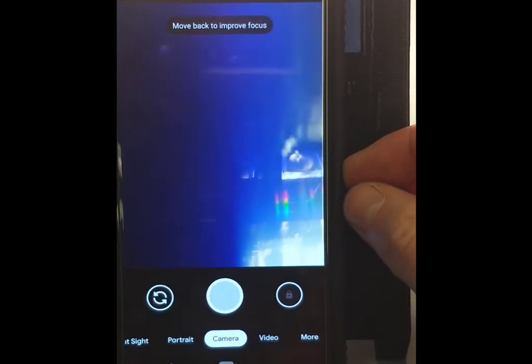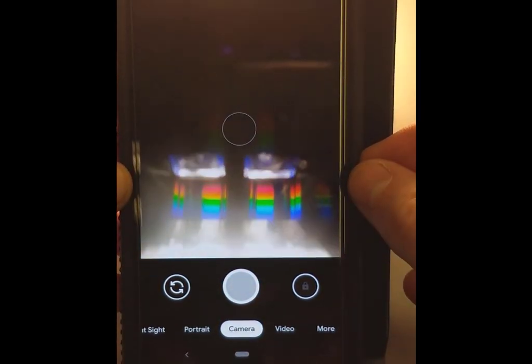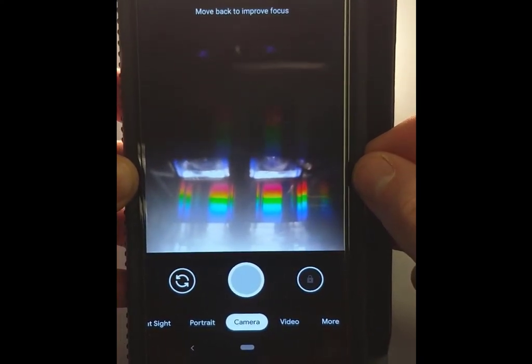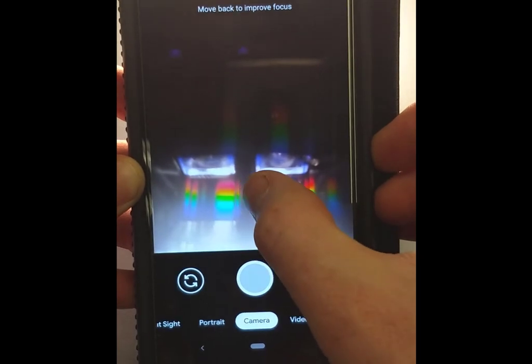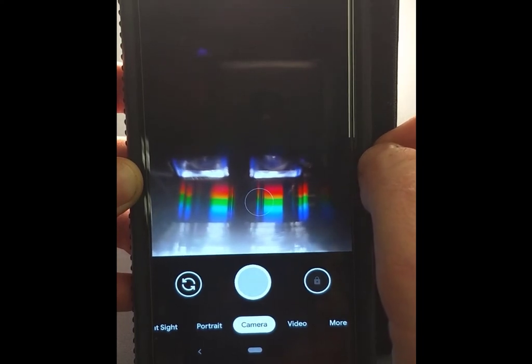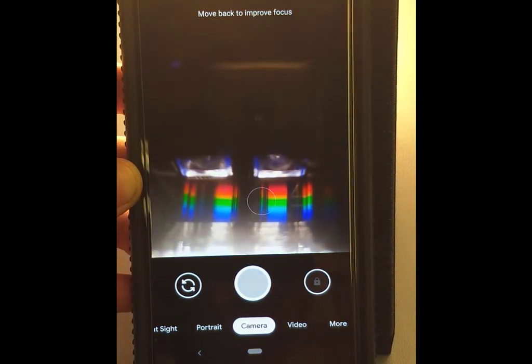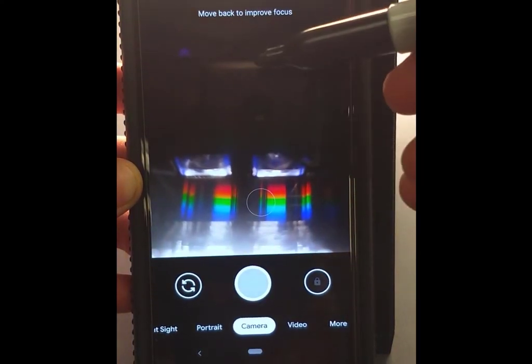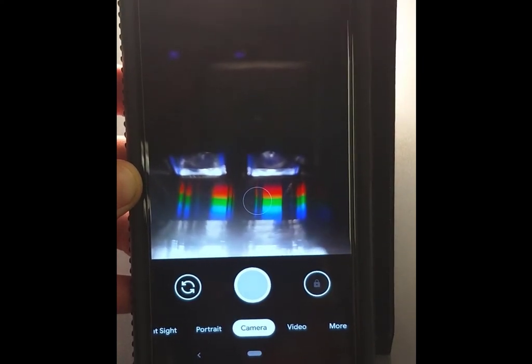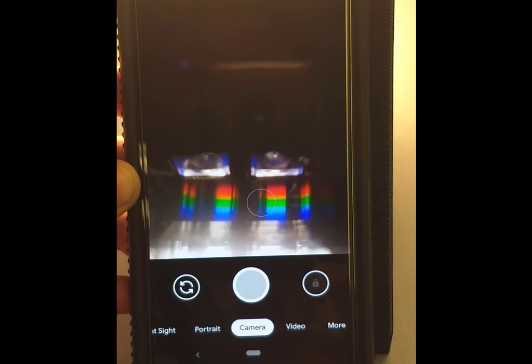Moving up or down causes you to start losing the spectrum. You're looking for two bands centered in the field of view. You may need to tap your phone screen to focus exactly on the spectrum. It's okay if it's not dead center — you just need it in the field of view. Once you have what looks good, take your marker and make marks at the top and on the edge so you know where to replace the phone when you put the velcro on.